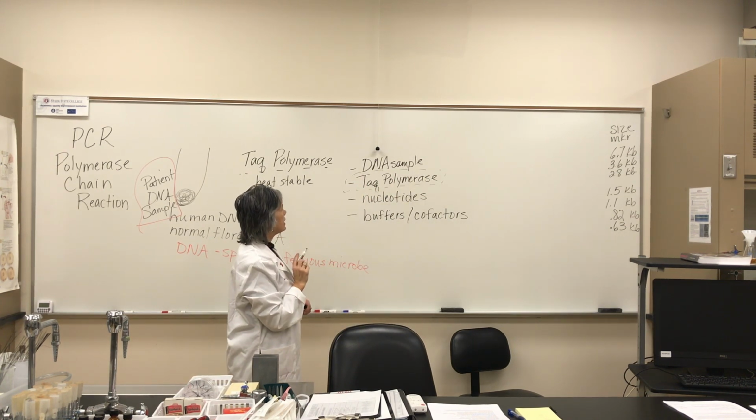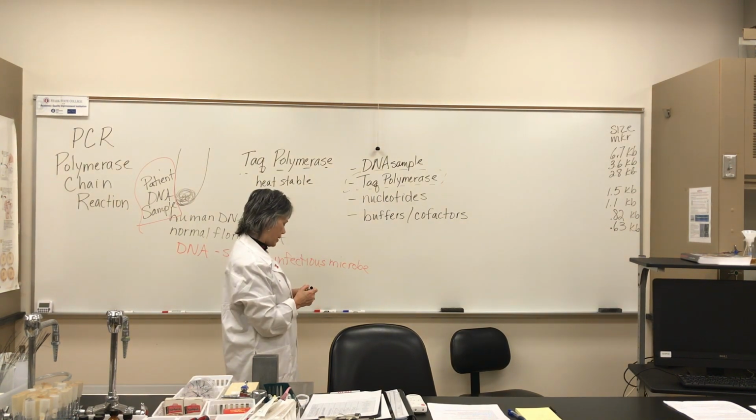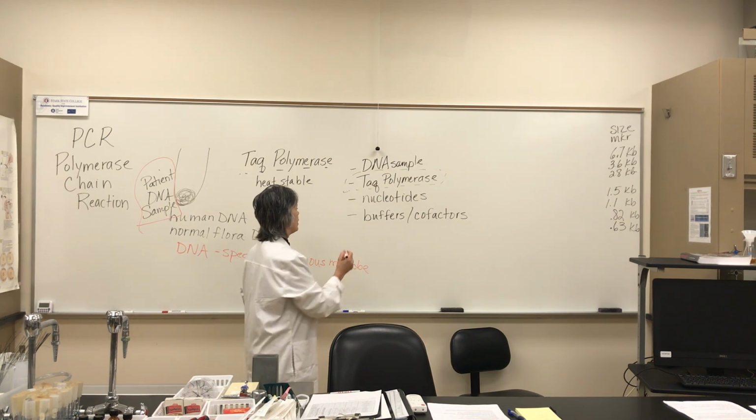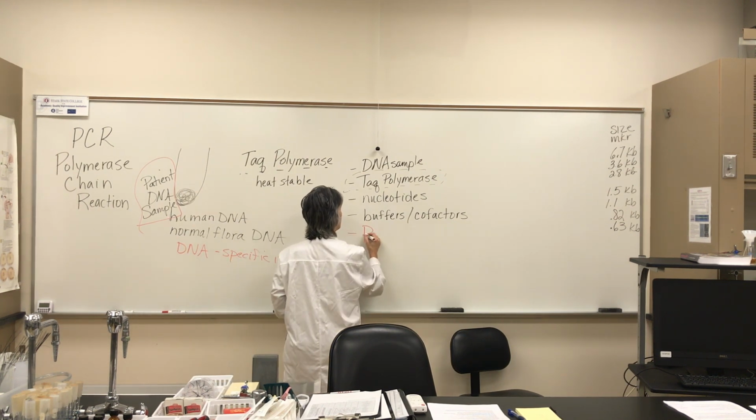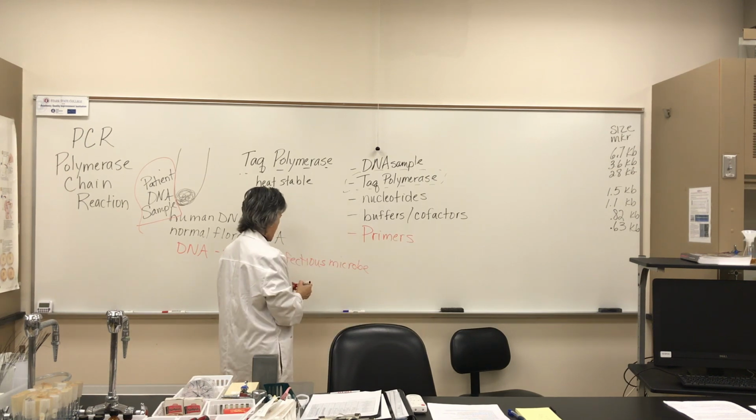All right, I've got Dr. Cheney helping me video. I'm going to check in with her. Am I forgetting any ingredients? Primers. Oh, key one. I'm going to put them in red. I knew I was forgetting something. Primers. Okay.